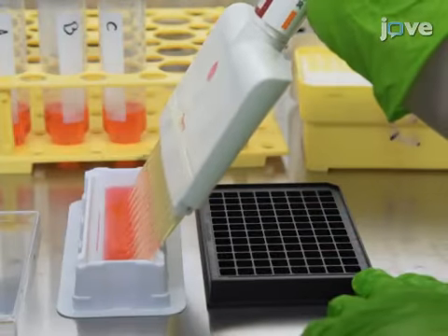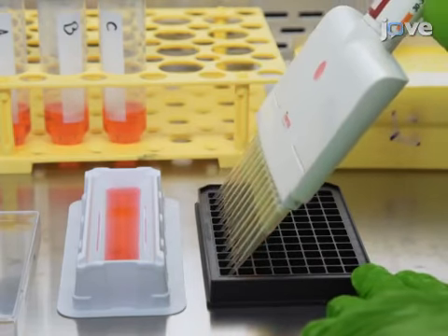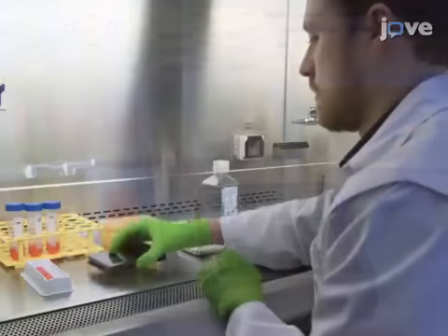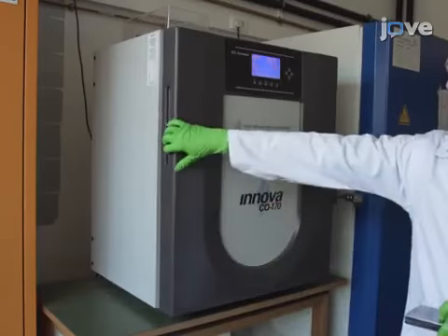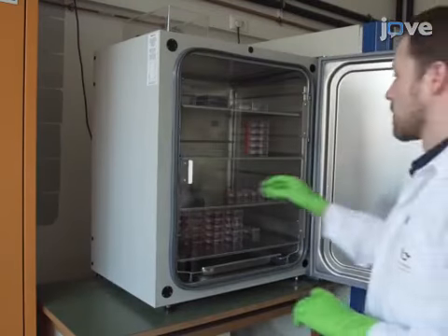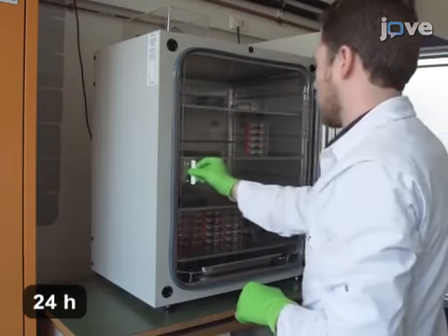Subsequently, fill the empty outer wells with medium to minimize the gradients between the wells and the environment. Gently tap the plate 3 times before placing it back into the incubator to avoid the cells from growing in patches. Culture the cells for 24 hours, or until they reach 70% confluency.